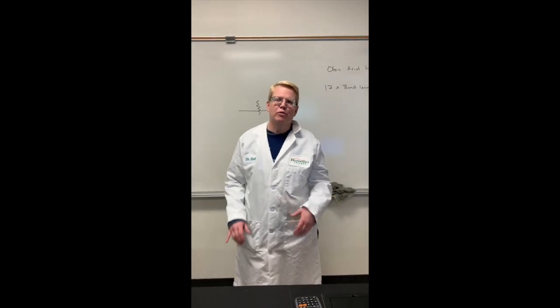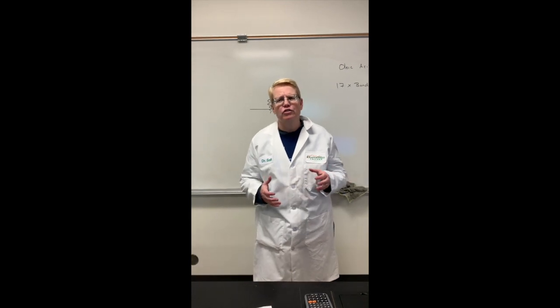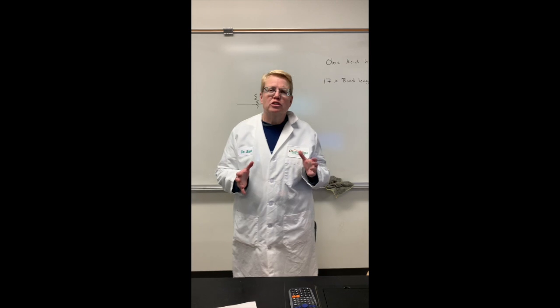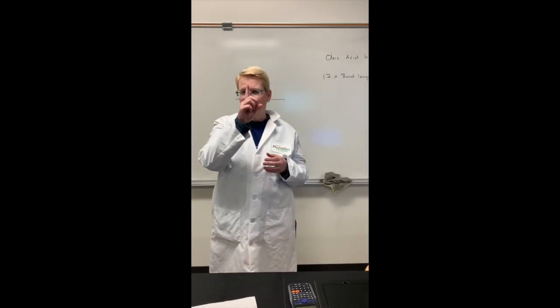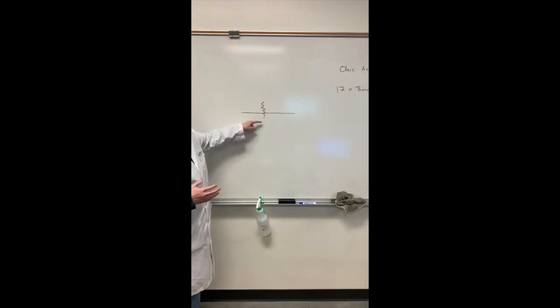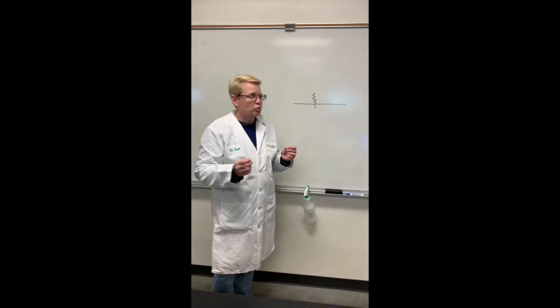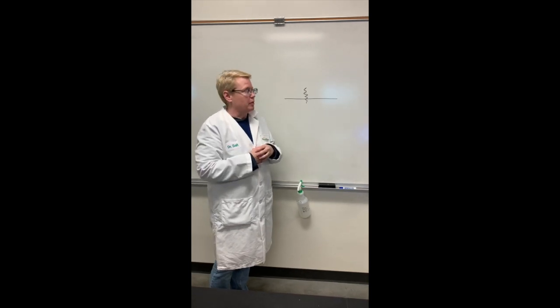So in experiment number 14, our goal is to find a carbon-carbon bond length. And the way we're going to do this is by using a molecule called oleic acid. Oleic acid in water will form what's called a monolayer, meaning that the molecule will stand straight up. So you'll have this carbon chain standing straight up, and it will expand out and push anything out of its way. Because it is an oil, it pushes the lycopodium powder out of the way, and that's how we do this.